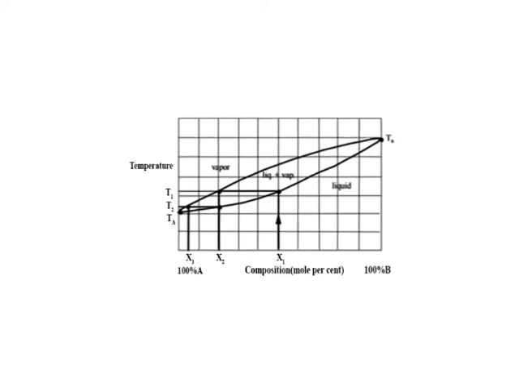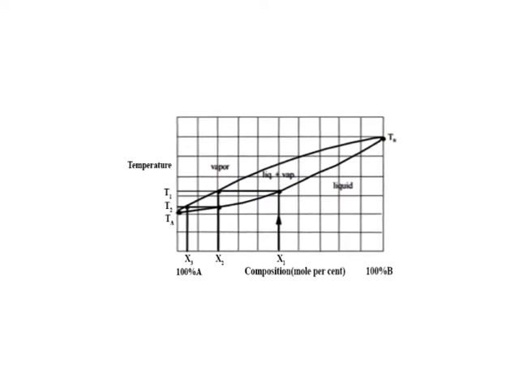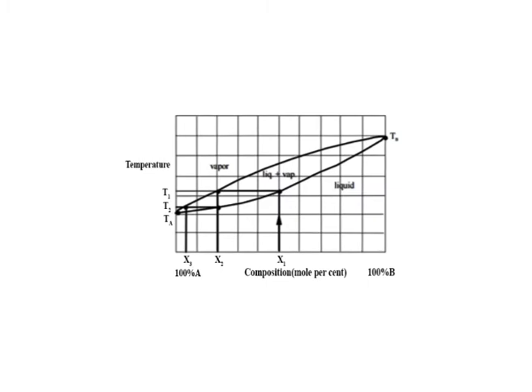During the distillation process of a liquid compound, the temperature of the flask will increase throughout the process. Let us assume the liquid mixture contains two different liquids A and B, and their boiling points are designated as TA and TB, and their vapor pressures are also different. So, you can see the vapor-liquid phase diagram on your screen.